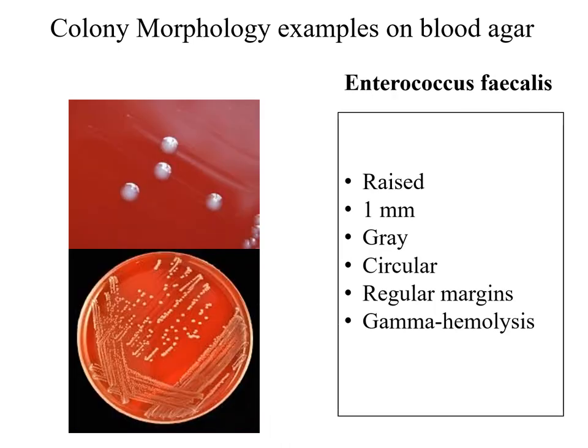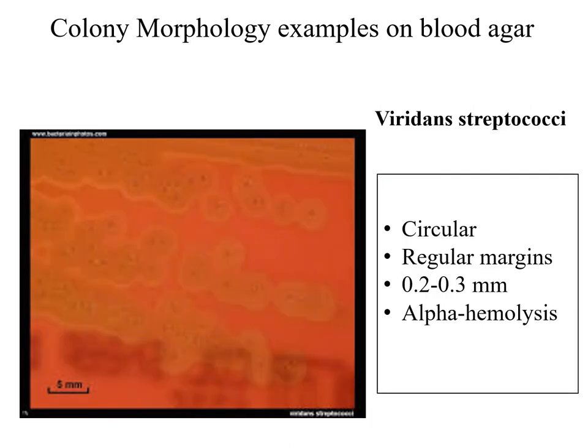Enterococcus faecalis: the colonies are raised, 1 mm in diameter, gray in color, circular, with regular margins. They do not exhibit any hemolysis pattern, so they are classified as gamma hemolysis.